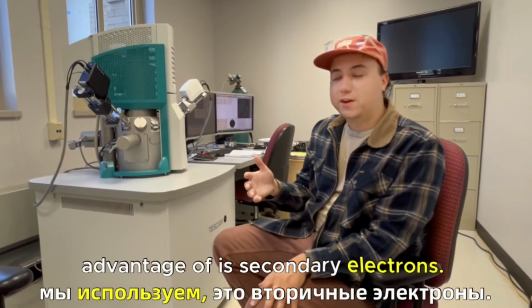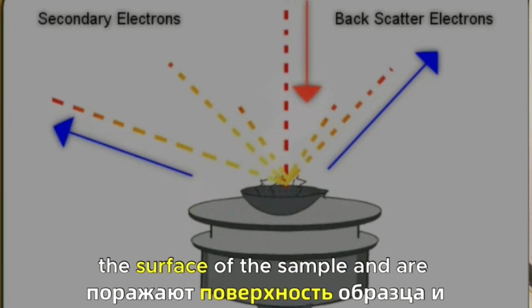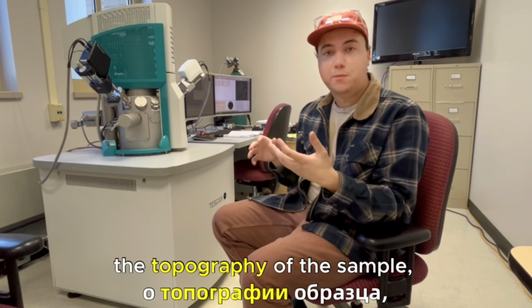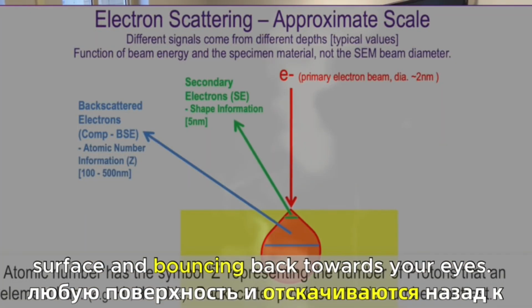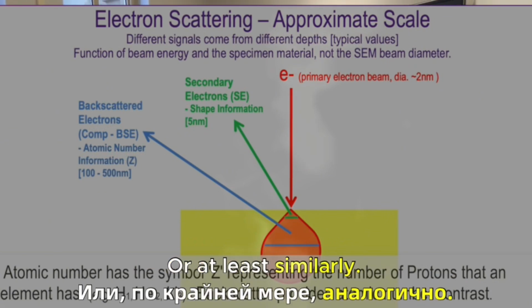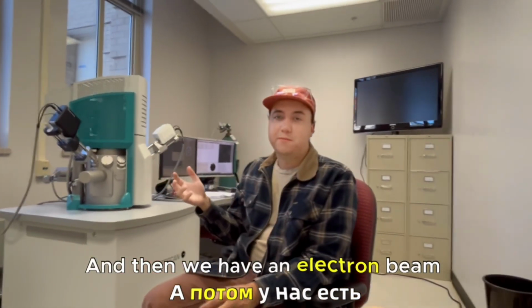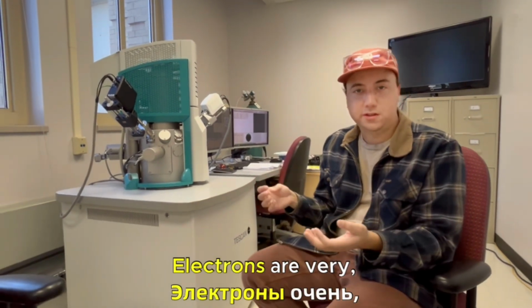Another effect that we take advantage of is secondary electrons. These are the electrons that hit the surface of the sample and are immediately reflected back. Those tell us about the topography of the sample, very much like photons hitting any surface and bouncing back towards your eyes. That's how secondary electrons work, or at least similarly. And then when we have an electron beam interacting with the atoms of a sample, electrons are very, very small.